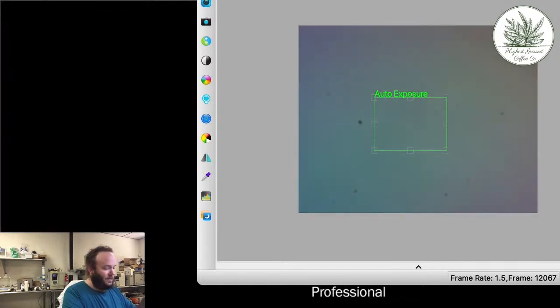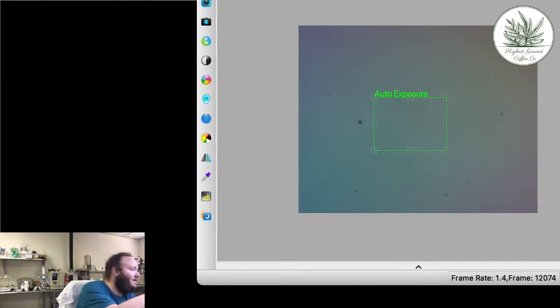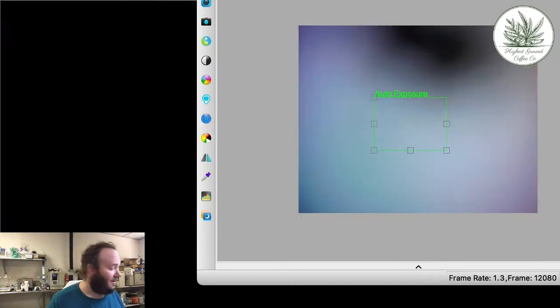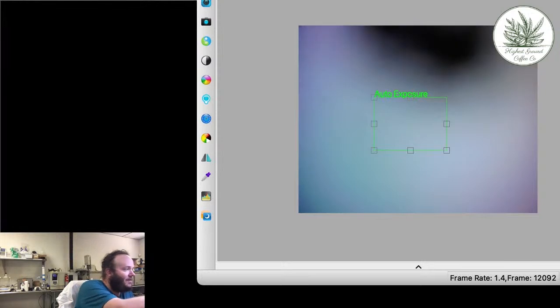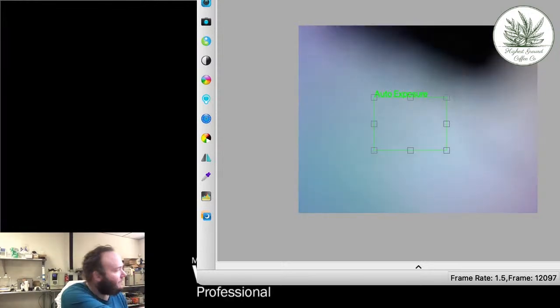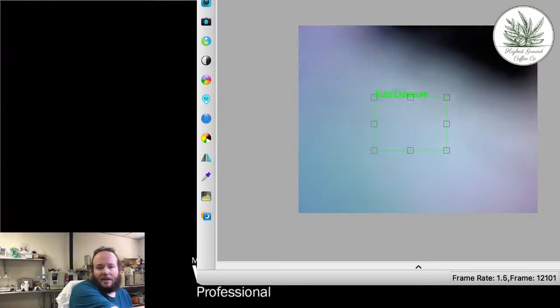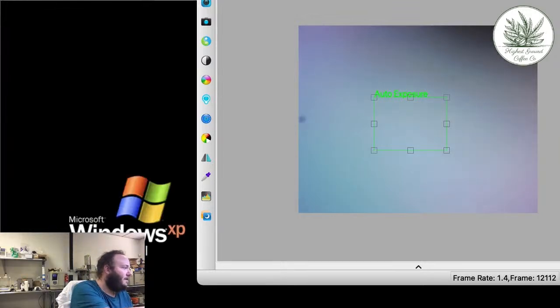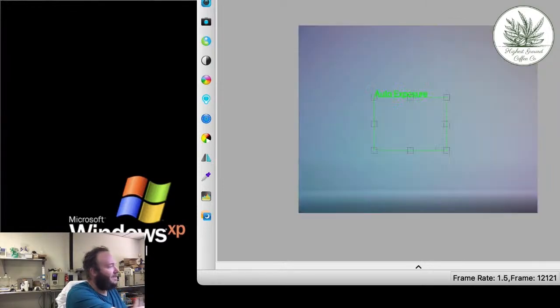Okay. Boom, boom, boom. So, minor tip, when you're using a microscope like this, one tip is to start at basically the lowest magnification to find what you're looking for, and then move up to the next one to actually zoom in on it.